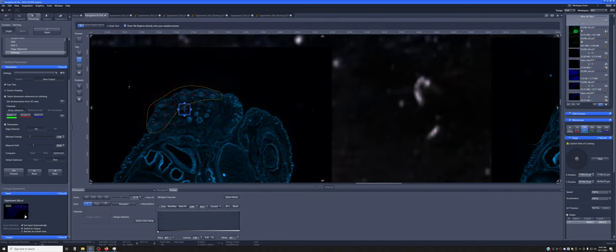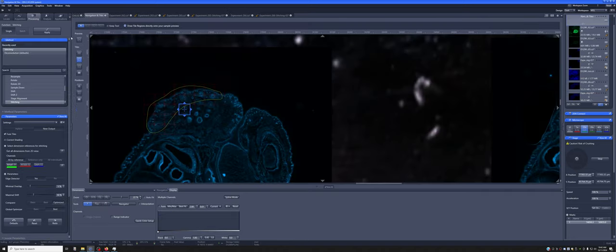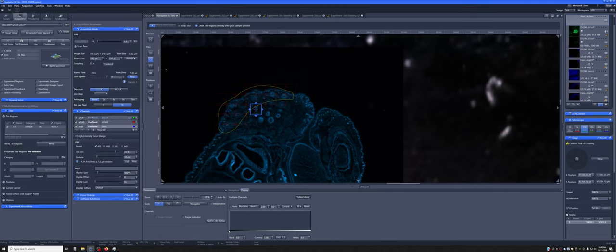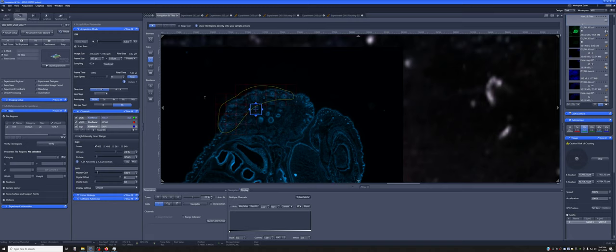So as you can see, this tool is extraordinarily flexible and it can be combined. You can combine multiple tiles. You can also combine this with Z-stacks, with time series if you needed to, as well as with individual points. And the individual points is something that we'll cover in another training video.